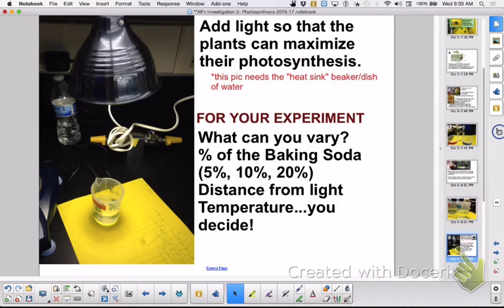And remember, you're going to put a light on them. Now, I want to try some different lights out. So group 1, I already switched your light out to a different bulb. But my other students, screw these on here like this. So it's up here. These get flipping hot. You will burn yourself.